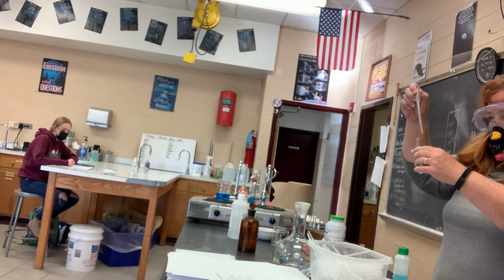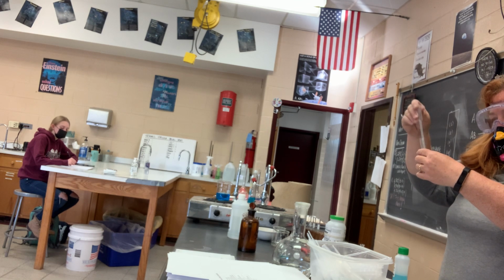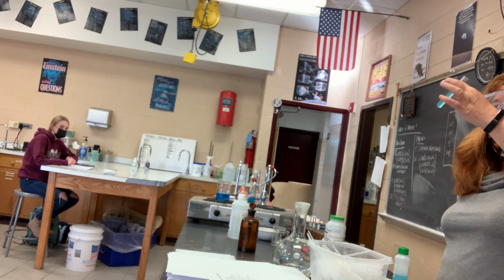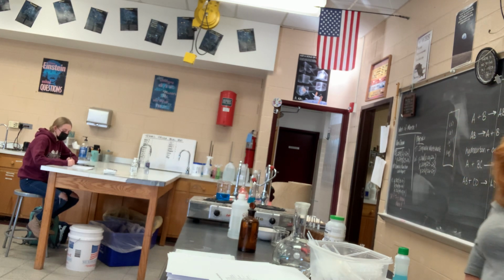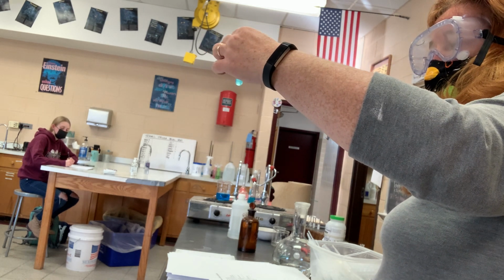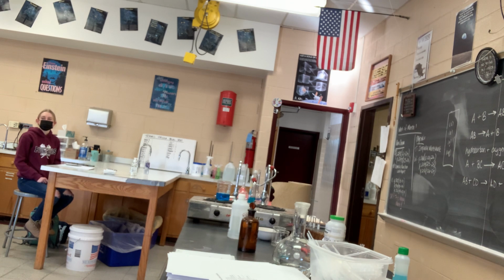I'll send this with it. You can kind of poke at it. It's thicker. I'm not going to do that, that makes a mess. There's particles in it. If the copper sulfate were more concentrated, like that stuff there that I'm using, it would be really thick. But you can see there's little particles in it.